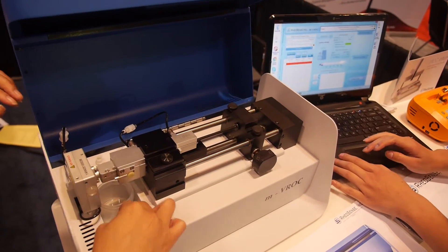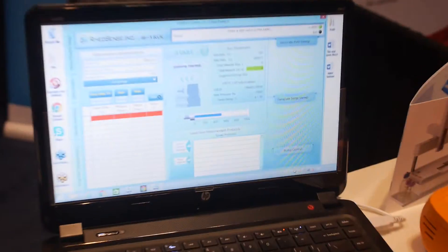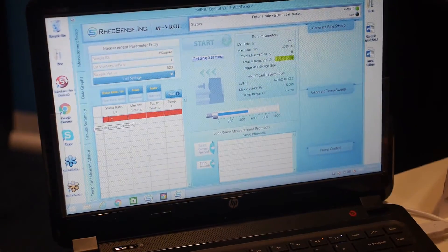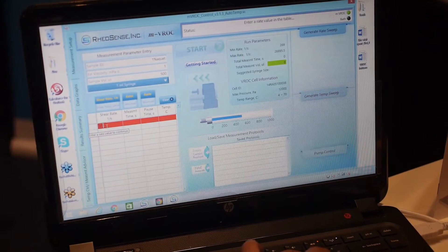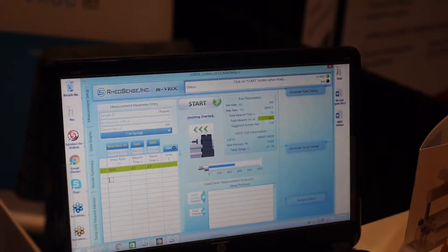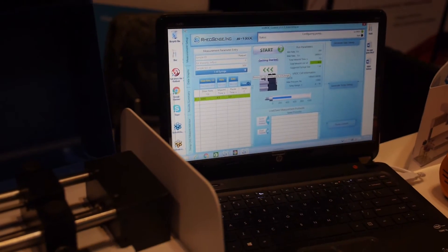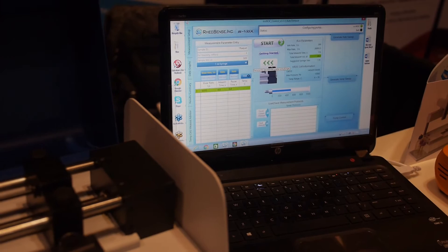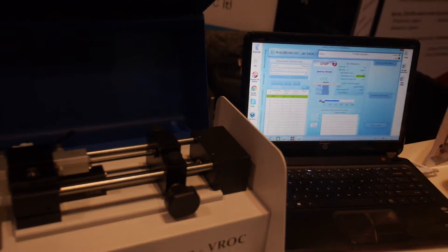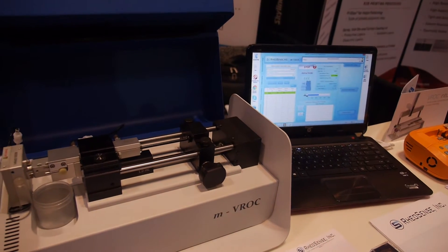We will begin our first measurement. My colleague Lulu is placing in the measurement parameters right now. You can enter the sample ID and estimate the viscosity — that feature is optional, so if you don't know the viscosity, don't panic. You also enter the sample volume, which is the amount of sample currently in your syringe, and you can customize and select the shear rate or flow rate at which you want the pump to flow.